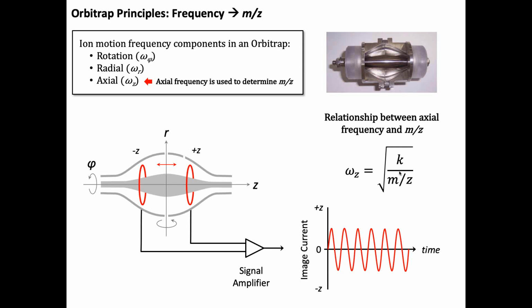Both. Yes. So typically in an Orbitrap, you're not going to be looking much above, let's just say, 3,000 to 5,000. Unless you're looking at the intact protein stuff, you can really extend that out, and you can buy instruments that are set up to do that, where the optics and other things are set up to really accommodate these larger.